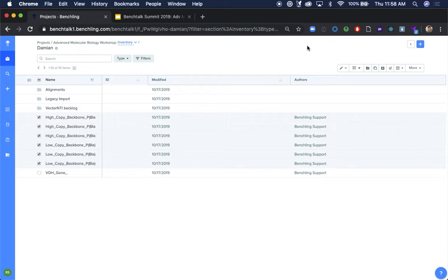So now we've annotated these sequences, and we've made sure we can associate particular regions of our vector with these tags. The next thing that you might want to do is attach some primers that you've designed. This is really powerful because it's a collaborative tool, right? If you're working with other scientists, they've designed a primer for, let's say, a common backbone that has the U6 or T7 promoter.